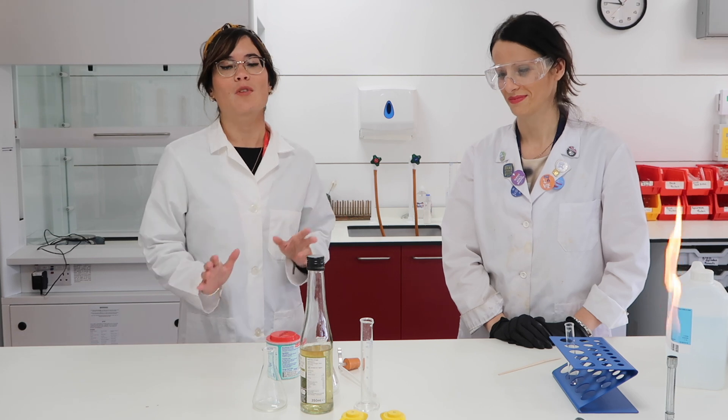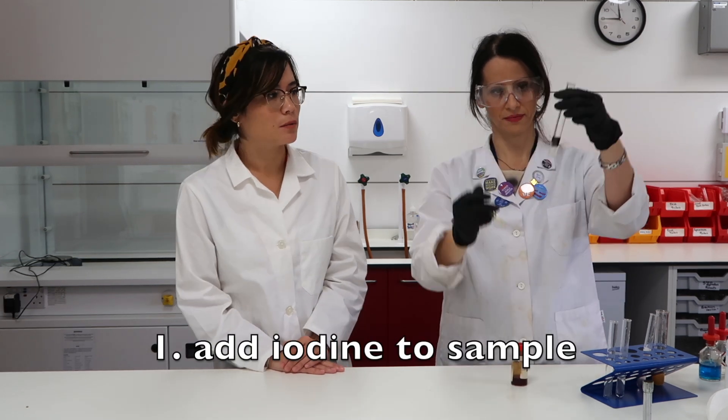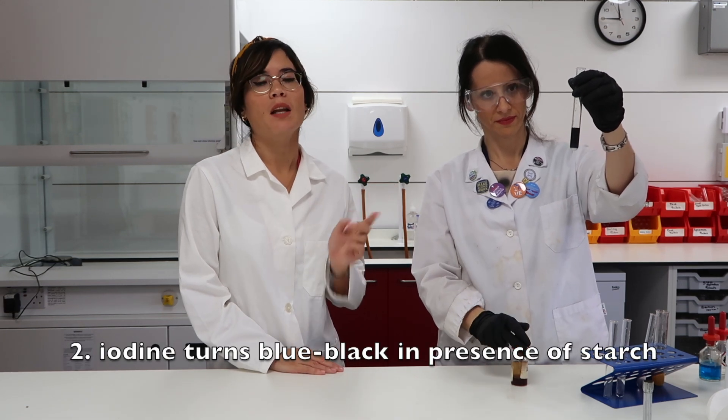I'm super excited because we're bringing Science with Hazel to the laboratory. In today's video, Amelia and I are going to show you how to test for starch. It's a fairly straightforward test — you simply need to use iodine, and you're going to place a few drops of iodine onto your sample. You'll see this very characteristic blue-black color in the presence of starch.